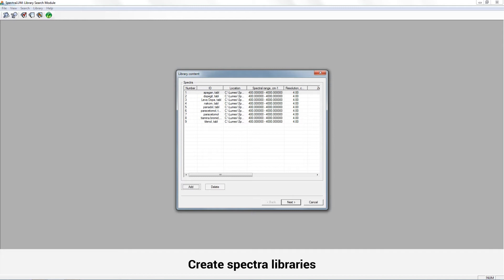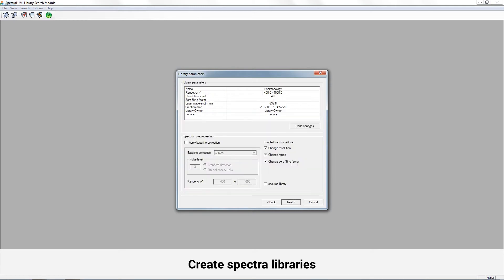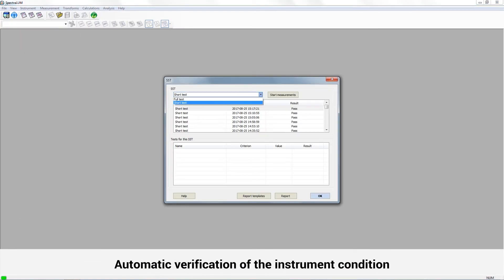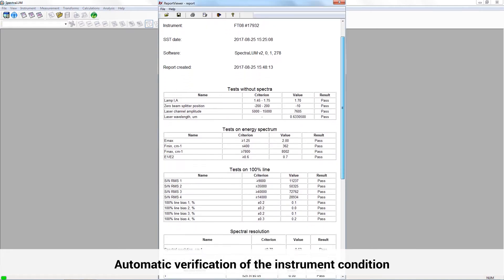For identification of a sample spectrum, you can connect to an existing spectra library or create your own based on a variety of file formats. Also, the software allows automatic verification of main instrument parameters and formation of a verification protocol.